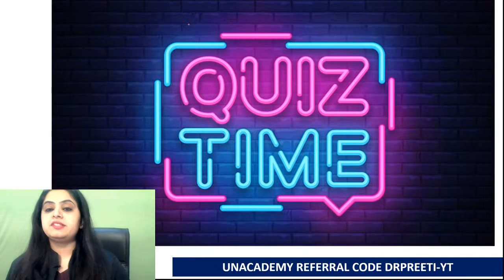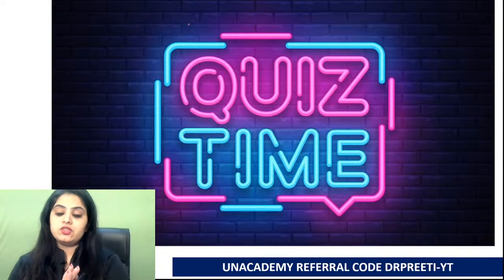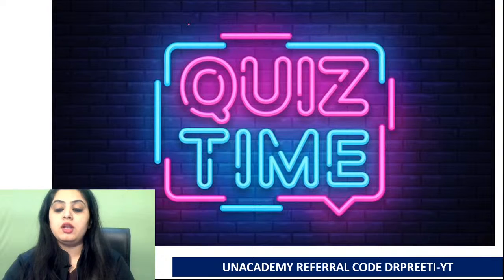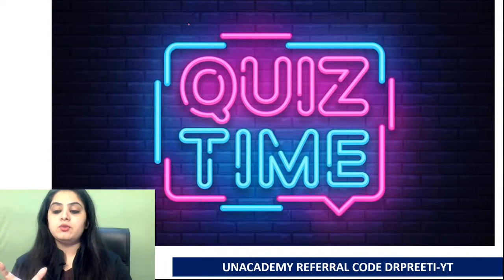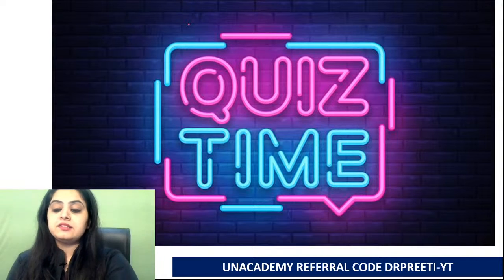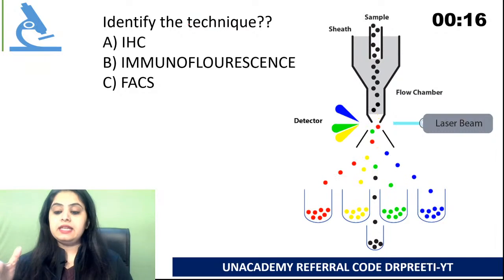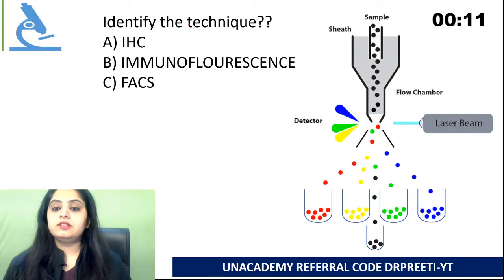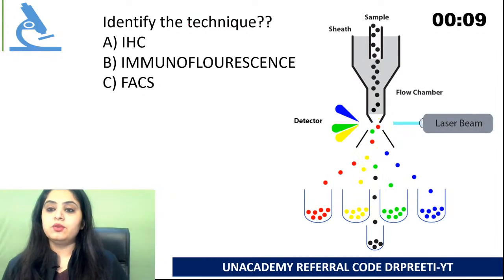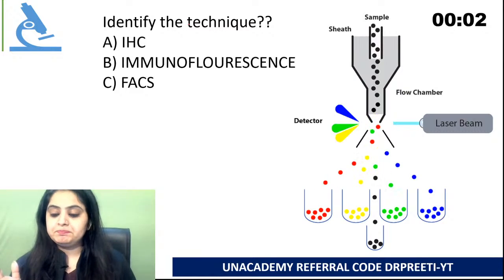Coming to the quiz time. Today's instrument based session is going to be a quiz based session. I'm going to put up a small question in front of you, and you have to identify the same for me. Let us begin without any delay. Let us start with question number 1. It's got a lot of GIFs also. There's a technique that I've put up in front of you. You need to identify: is it IHC, is it immunofluorescence, or is it FACS? Whatever you feel is the correct answer, let me know. I'll give you a 20-second timer which is up on the right, so you need to abide by that.